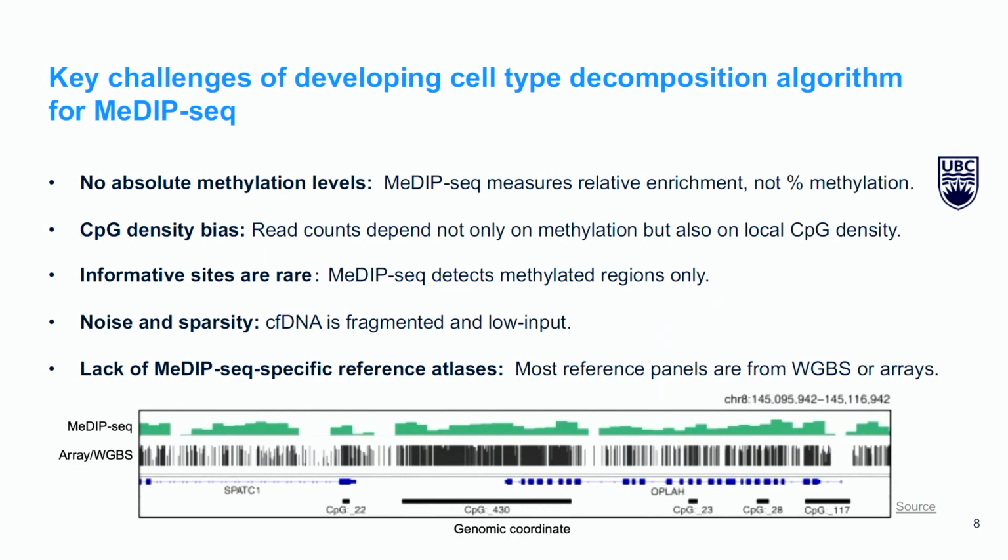However, this MeDIP-seq technology has been around for quite a while, and a lot of people are using it for liquid biopsy, but there has been no cell type deconvolution algorithm developed for it because it's very challenging.